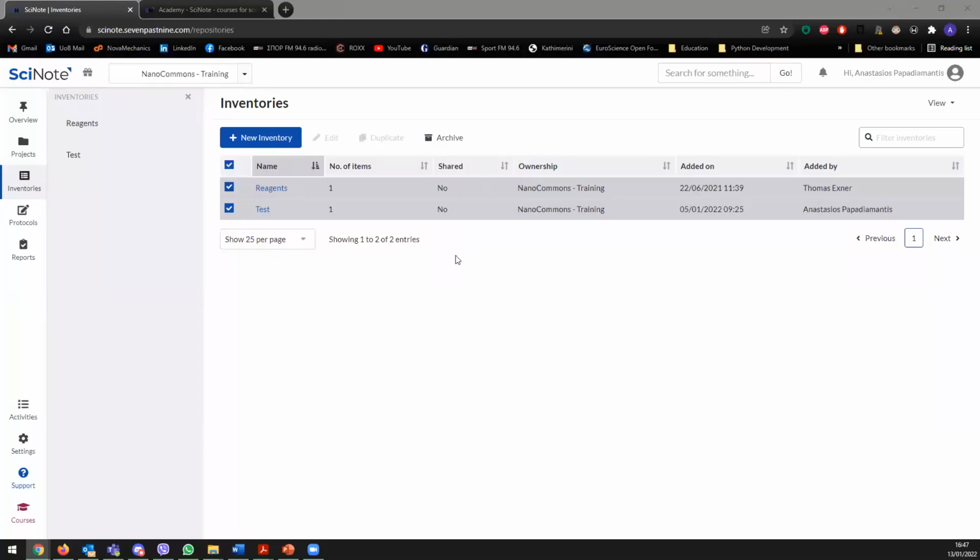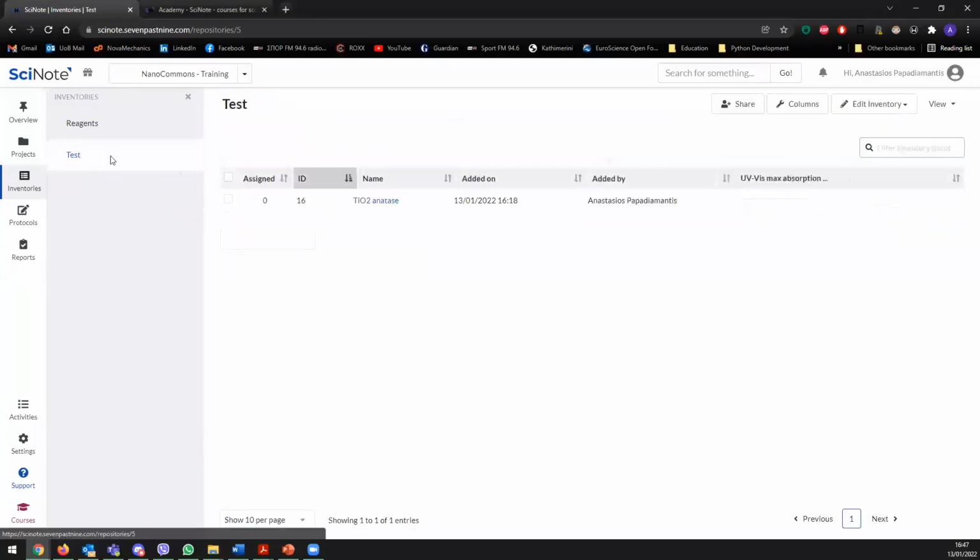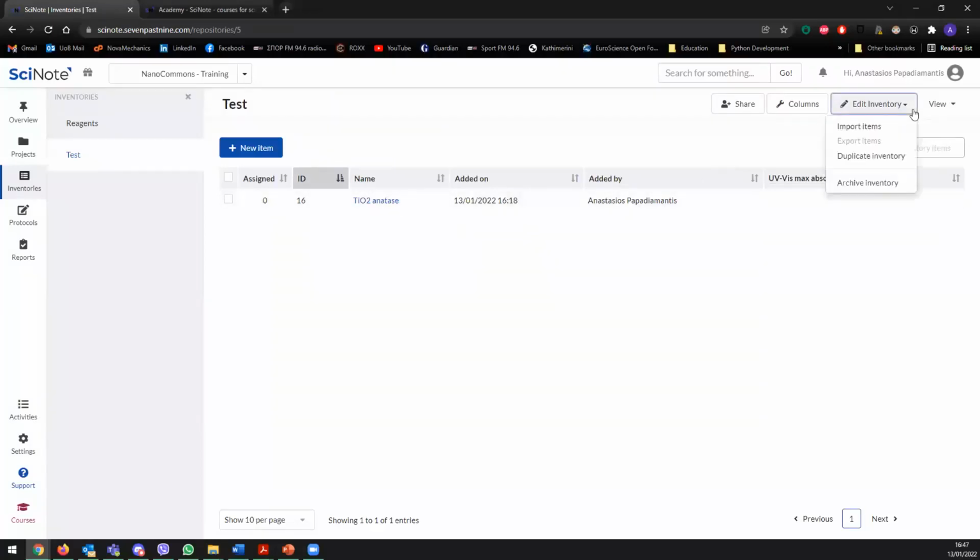If you run into problems, we have at the moment no experience how resource intensive that is. We are also still learning, and it's very good to have this information for you when you decide at one point to take that in-house, so that you know directly what you have to prepare for. That's more or less everything.